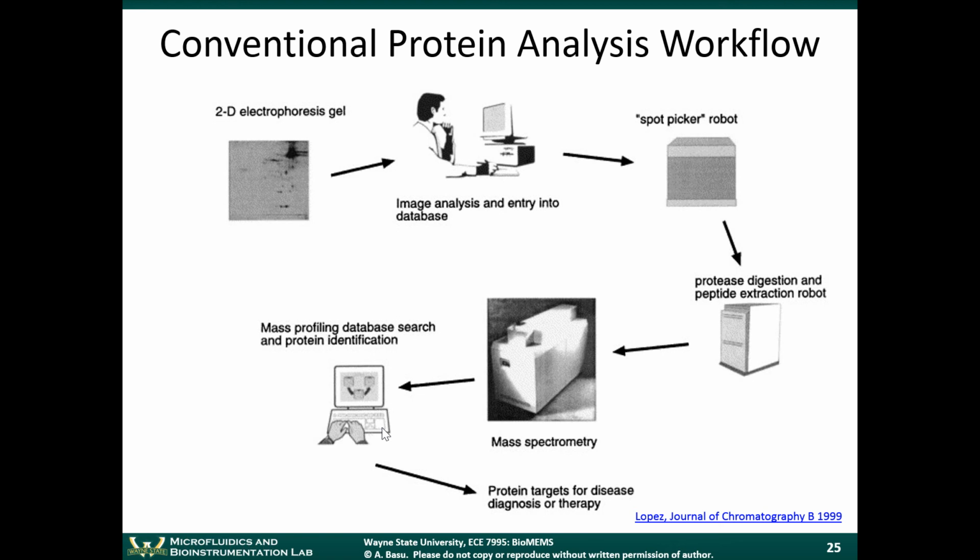It breaks up a molecule into constituent pieces and is able to identify each one of those pieces. In the case of proteins, the protein can be fragmented into the building blocks called peptides, and the mass spec can actually tell you what those peptides are and how much of them there are.